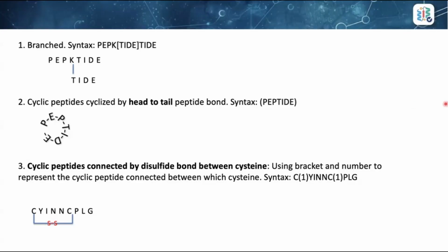This sequence can contain unnatural amino acids or unnatural nucleotides. And ProteoformX enables you to directly use this linear syntax to represent such complex molecules.